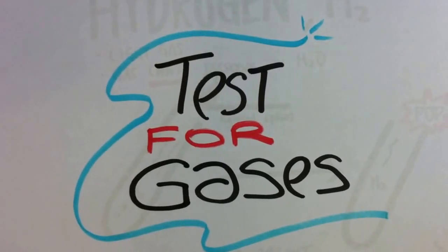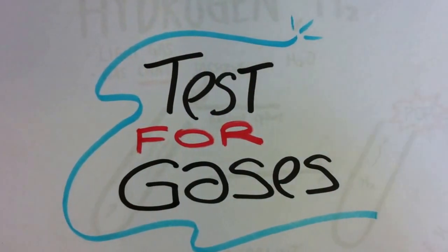Okay, this video is on a test for gases and how we test for gases in the lab.